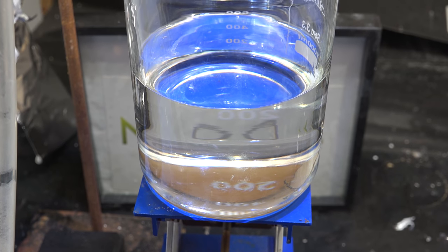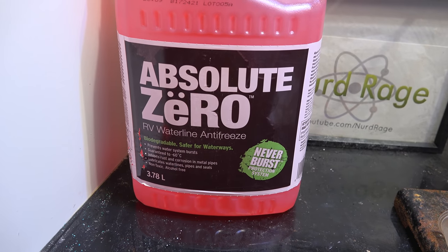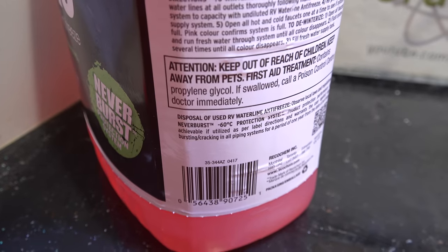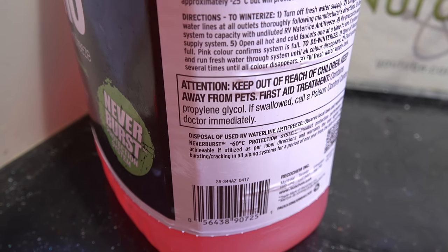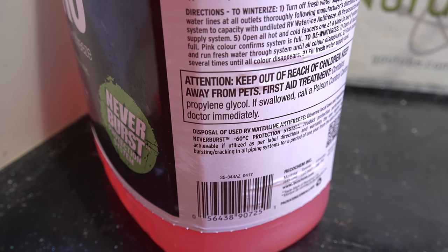Anyway, first we need our source of propylene glycol. I'm going to use this waterline antifreeze meant for RVs. Make sure it says somewhere on the label that it's made with propylene glycol. You can also use pure propylene glycol from electronic cigarette liquid if that's available to you.